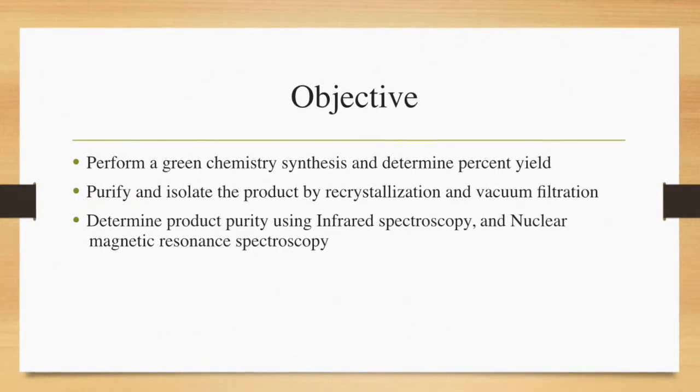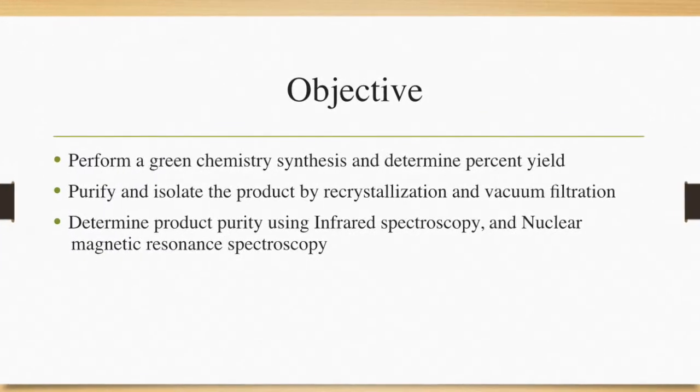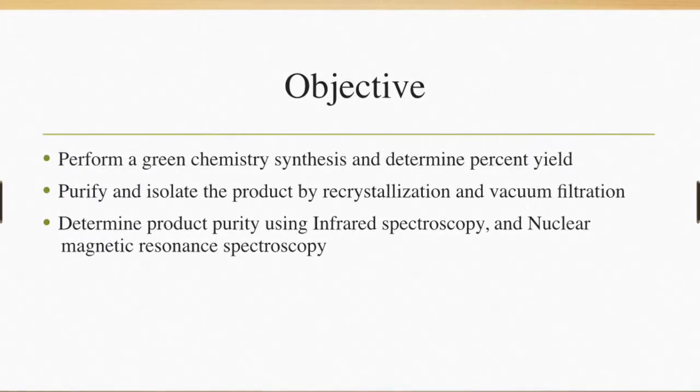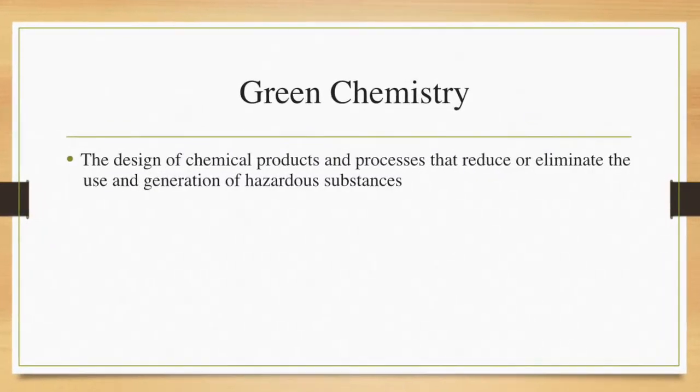The NMR spectra for H1, C13, and DEPT 135 were consistent with the intended structure. The percent yield was extremely low, which could be due to inefficient drying and recrystallization process.